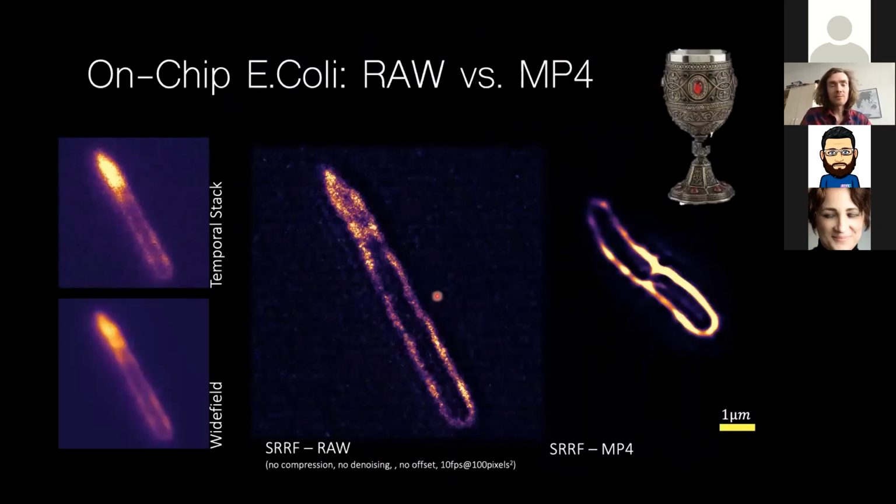And so we pushed this topic a little bit further, and we were able to, well, get around the limitation of the cell phones in terms of camera. So usually all the cameras, they have lots of image processing done on the chip so that you can really make nice photos at night, and you can see people on images quite nicely. But this is, well, a massive problem in scientific imaging, where you really need raw data, so you need to be quantitative. And so we found a way to take images at a reasonable frame rate in a raw imaging space.